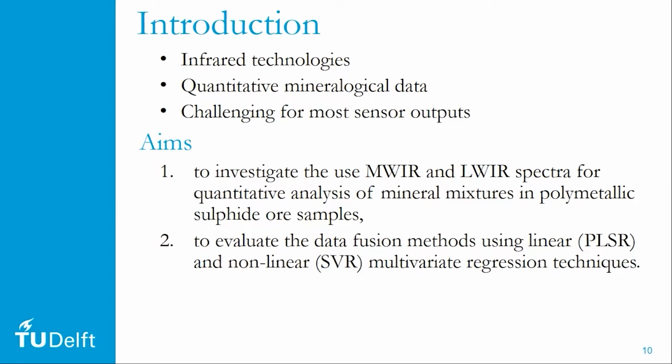However, quantitative analysis of minerals is challenging for most sensor outputs. And it requires advances in data analytics. The aims of this study are twofold. One is to investigate the use of mid-wave and long-wave spectra for the quantitative analysis of minerals in polymetallic sulfide ore samples. The second objective is to evaluate the data fusion methods using linear and nonlinear multivariate regression techniques.